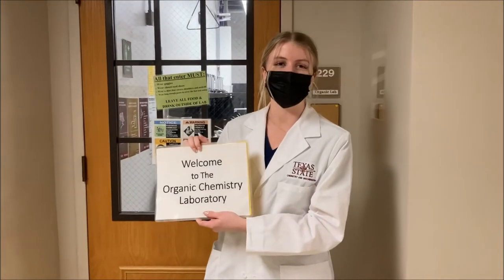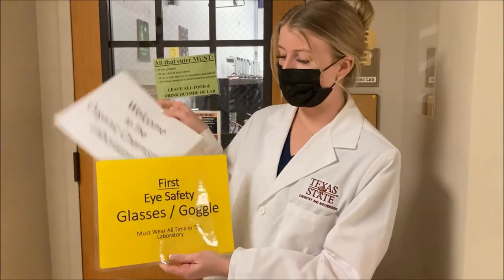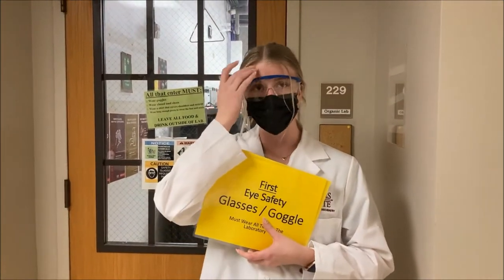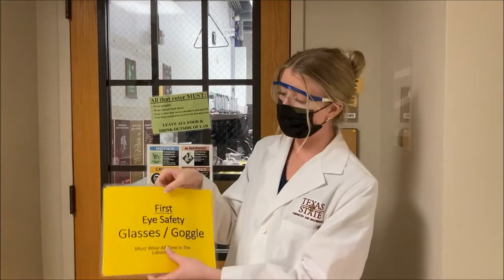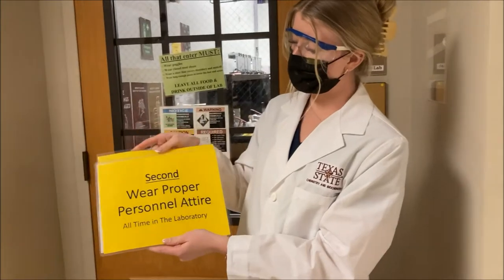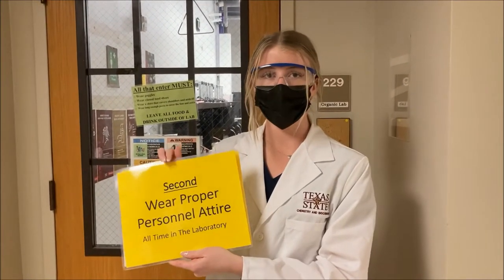Welcome to the organic chemistry lab. The first thing you're going to do before you come into lab is put your safety glasses on. After you have your glasses on, you're going to make sure you're wearing the proper attire for the lab.